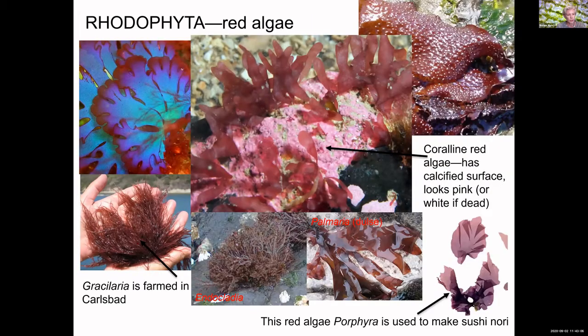So when we look at examples of the Rhodophyta or the red algae, they are going to have a pretty reddish or purplish, even sometimes dark black almost looking color. And so we have some examples here that are just to show you when I say red algae, this is what red algae look like. You're only going to be asked to recognize them by eye, and I will only give you easy, clear ones.